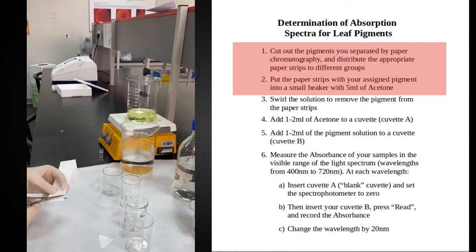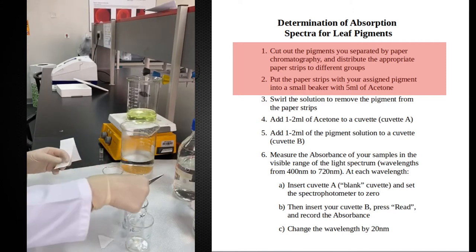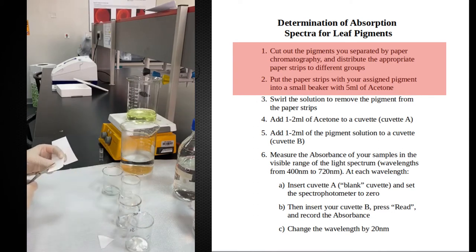I have in my beakers in order chlorophyll B, chlorophyll A, xanthrophil and carotene.